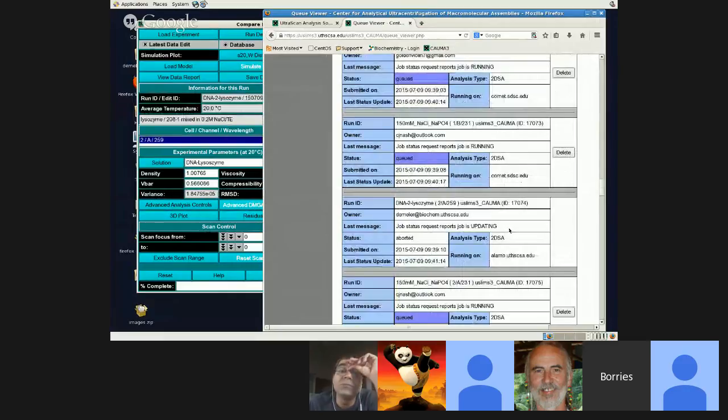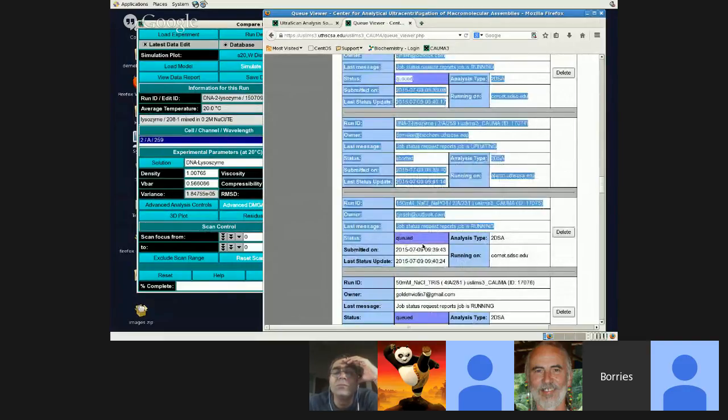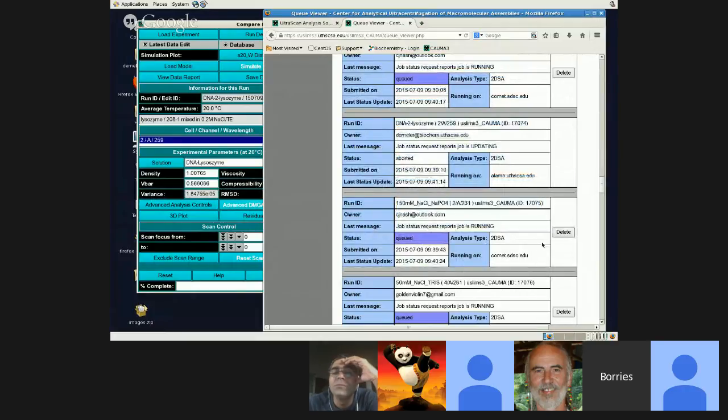Job status reports, oh, it's updating and it was aborted, so something didn't work out. I'm not really sure what happened here. We need to take another look at that.